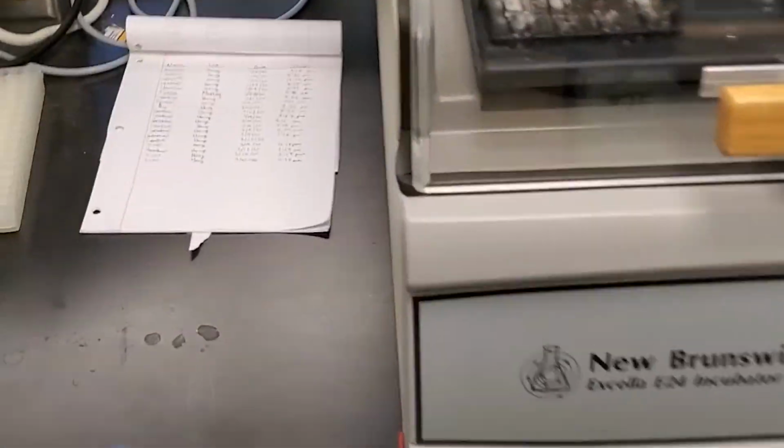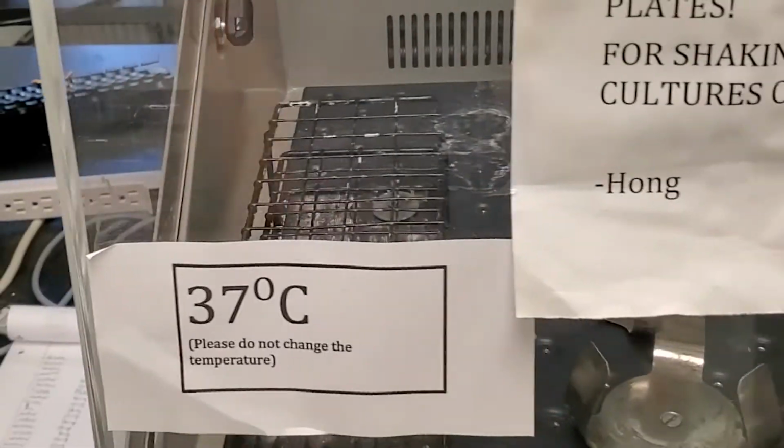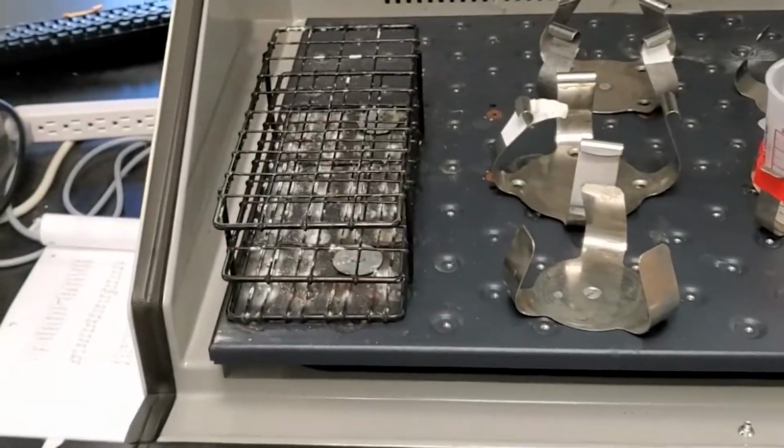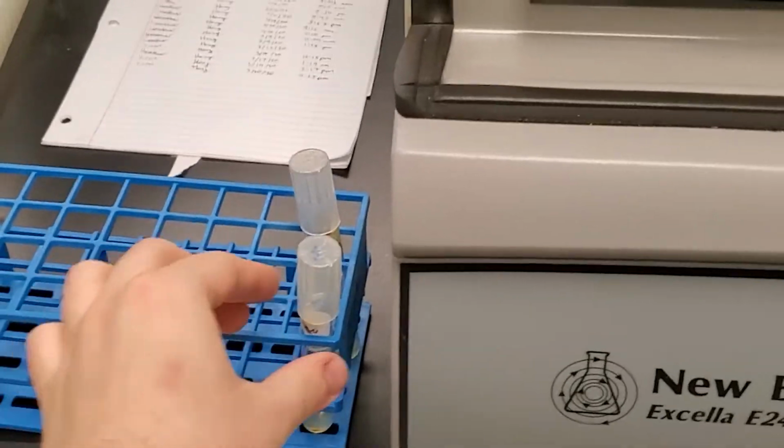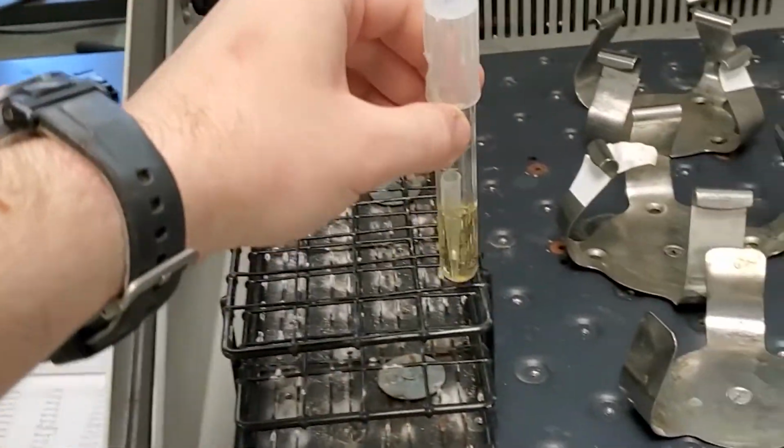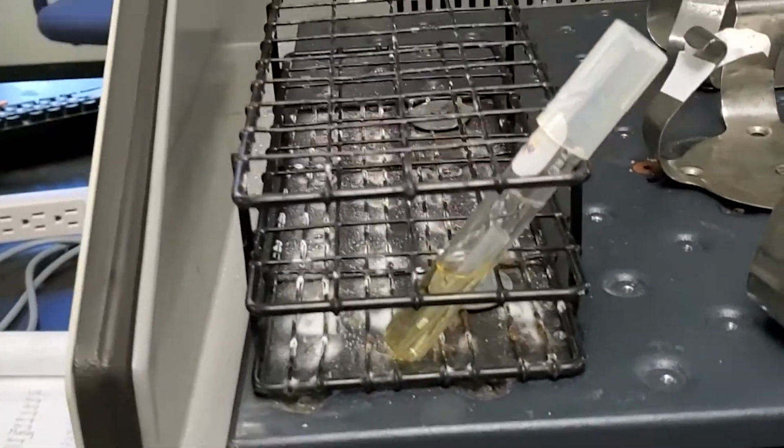Liquid media cultures are to be grown in a shaker incubator. Place the tube at an angle to allow sufficient aeration.